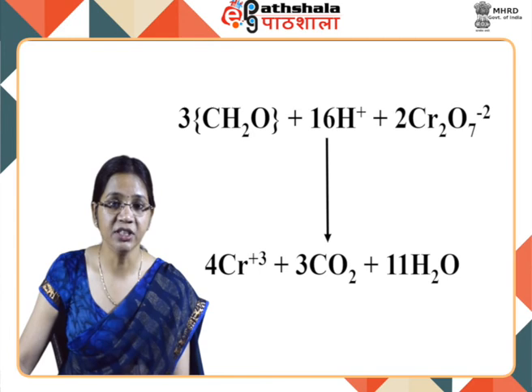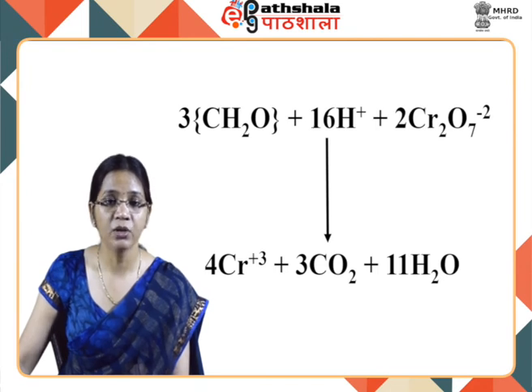Following the digestion, the extent of oxidation is measured through indirect measurement of oxygen demand via electrons consumed in reduction of chromium 6 to chromium 3. This can be done by titration or spectrophotometrically. The water sample is heated with a known quantity of potassium dichromate for several hours and the unreacted dichromate is then determined by titration with standard Mohr's salt solution.